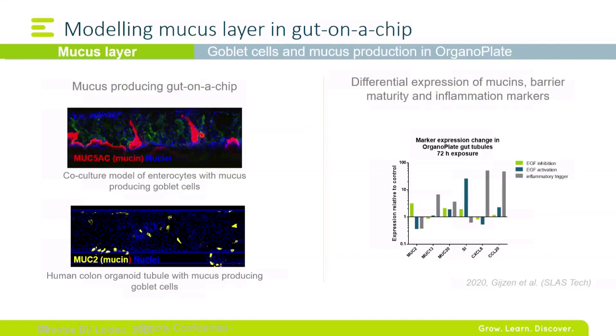So we actually did a great study which was published with Estelas, and Kazu is going to talk after me, where we looked into the absorption of drugs over the intestinal barrier, and mucus makes a world of difference here.